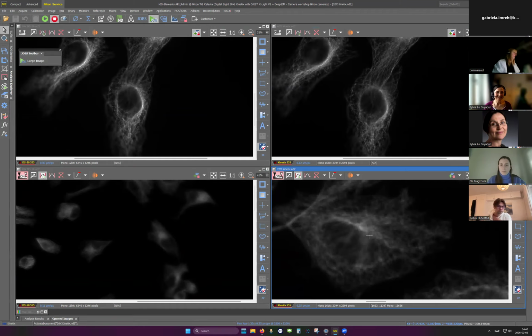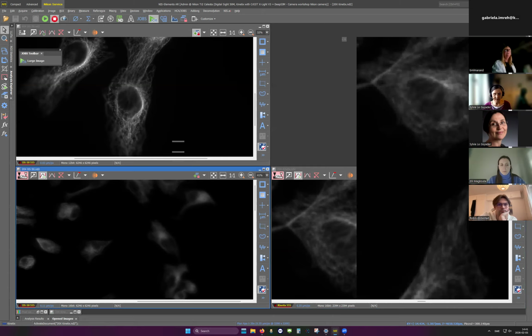On this microscope, there is an extra additional magnifier lens that we can add that gives you 1.5 times extra magnification. If we use that with the same wavelengths, the 525 and the 20x objective here, then we should have 5.7. If you calculate it according to Nyquist, the pixel size should be 5.7. So we are closer to Nyquist by adding the 1.5. If we have time, I can actually do that.